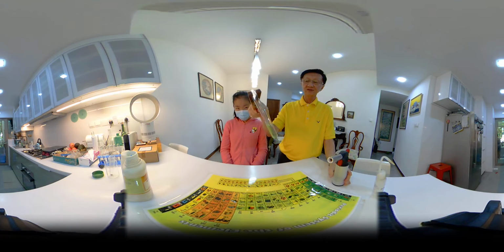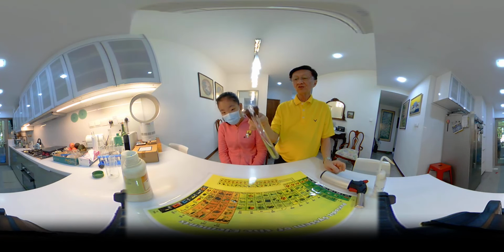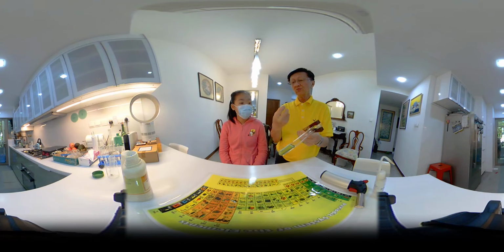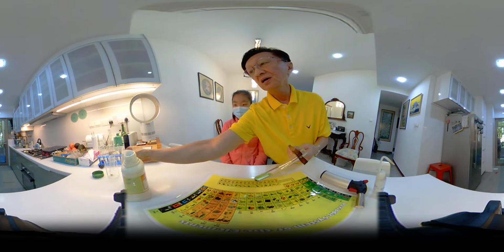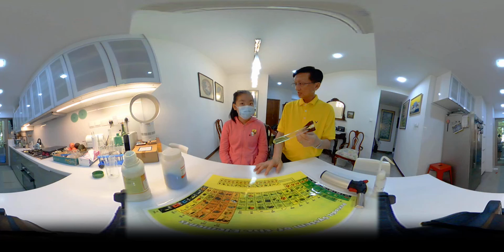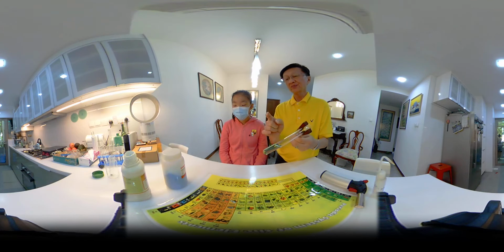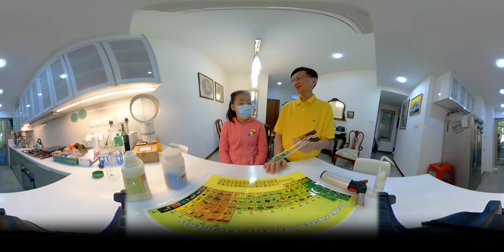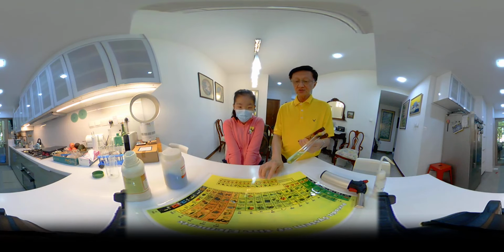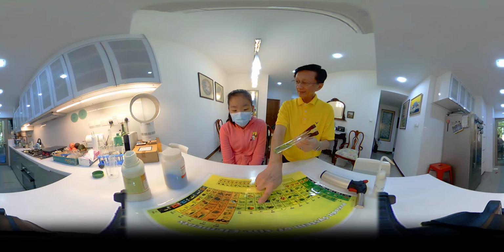the acid. Okay. Now, I think we did an experiment before, and we asked you how do you remove the blue color from blue copper sulfate solution. Now, I want to remove the green color from the green nickel sulfate solution. How do I remove this color? You see, the color here is due to nickel Ni 2 plus ions.